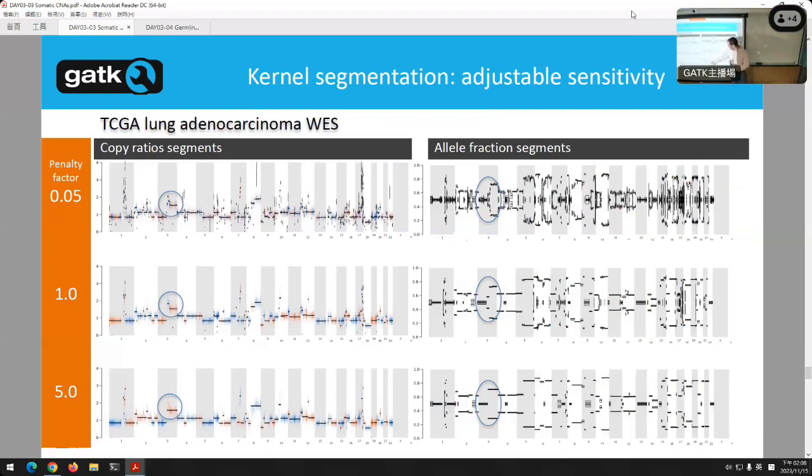And you turn the knob more, and you see here, this is copy ratio 1/2. Okay, and then all of a sudden, what happens? You've got something happening. You get one of the chromosomes that has now both been duplicated and deleted. Fun things. Okay, but you only see that as you tune the resolution. So sometimes with copy number calling, you do have to rerun things a little bit, and that's why we give you the tools to plot things so you can see it yourselves.